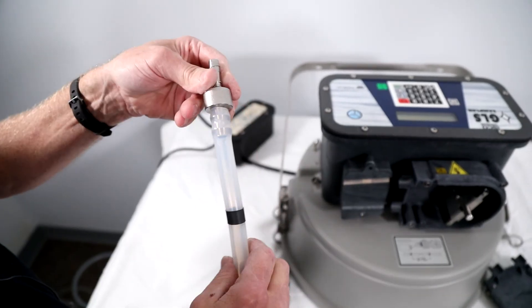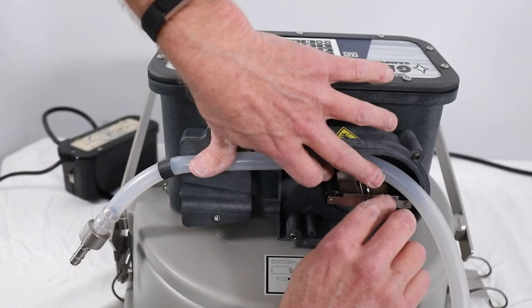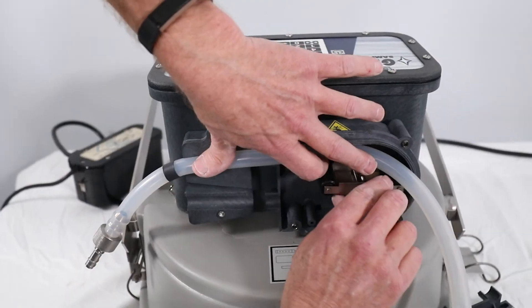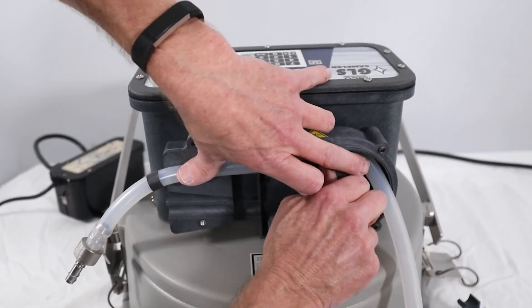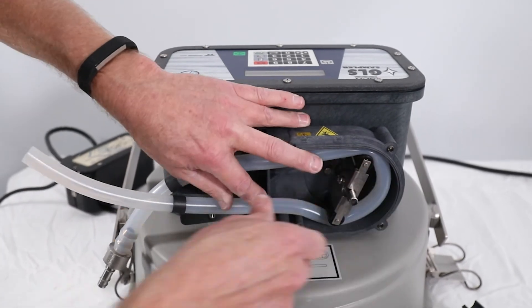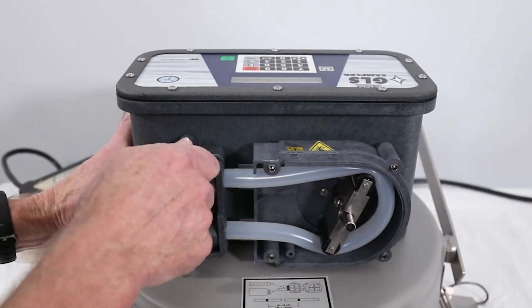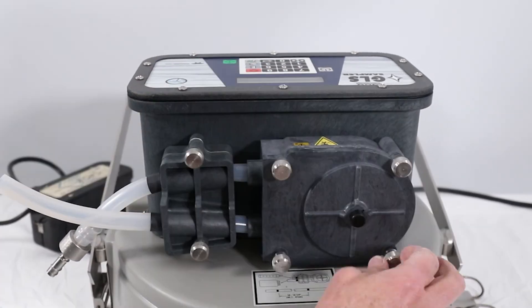Reinstall the tubing coupler to the new pump tube and install the tubing so the inlet end with the tubing coupler fits into the top groove in the liquid detector housing. Push the tube through the pump rollers. It can be helpful to rotate the pump rollers by hand in this process. Reinstall the liquid detector and pump housing covers and tighten the thumb screws.